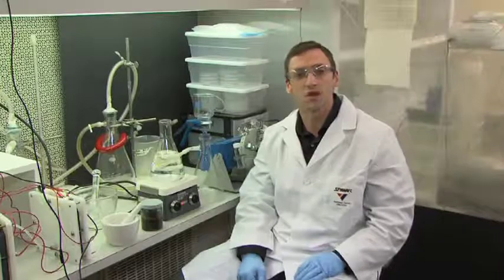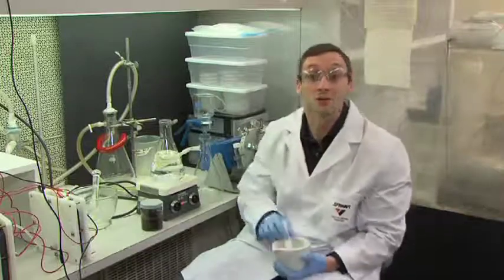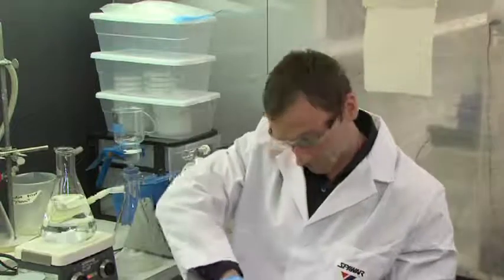The solid phase goes on to step 2, particle size reduction. The solid material may be no larger than specified limits. Otherwise, it must be crushed, cut, or ground up.